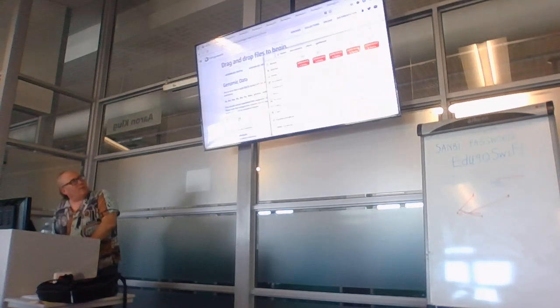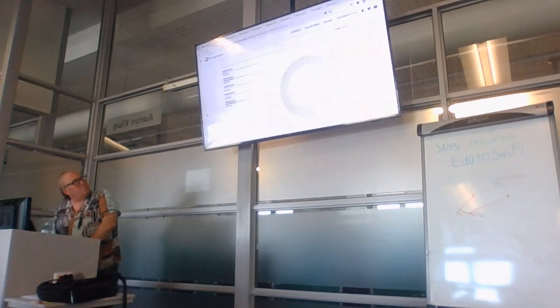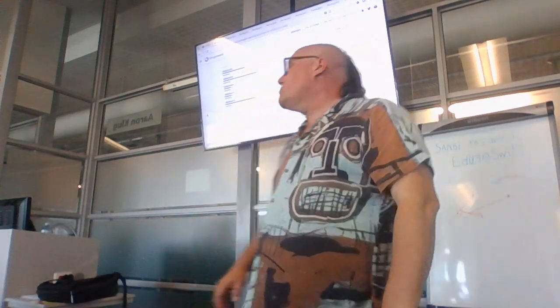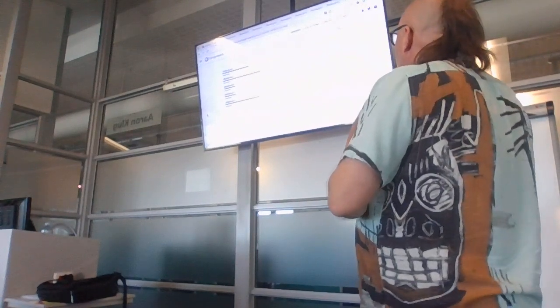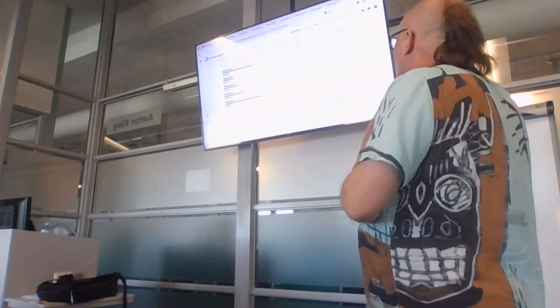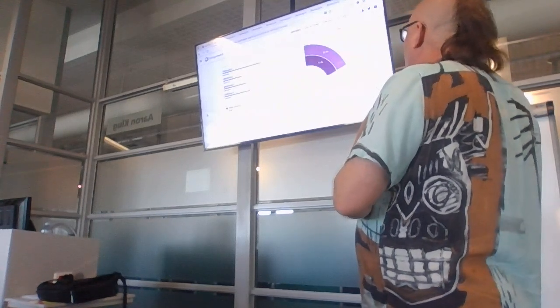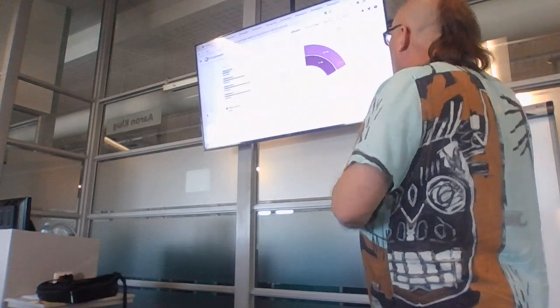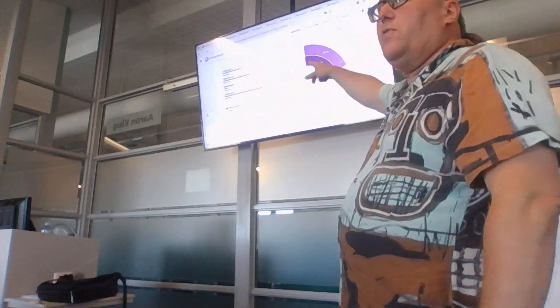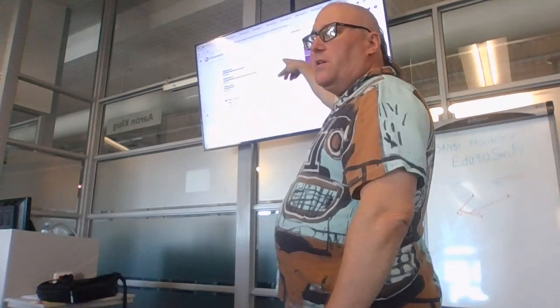Okay, so now that I'm on this page, I can drop my data there. And it's uploading just the consensus sequences, right? And as it uploads, you can start seeing the analysis running. It already has identified that this is Vibrio cholerae. It has identified that it's Vibrio cholerae sequence type 69 using MLST.